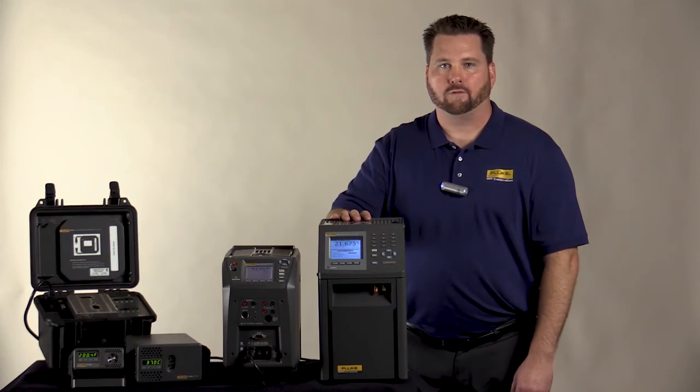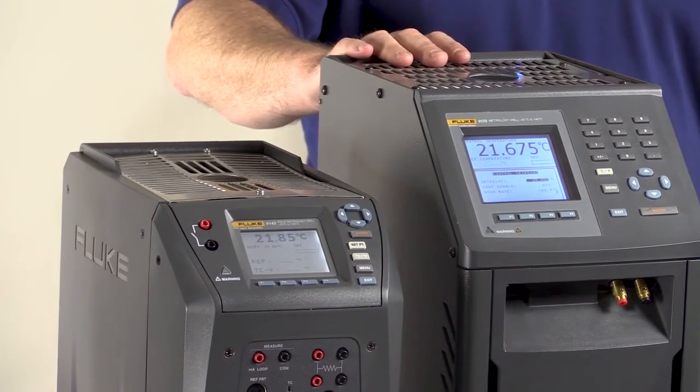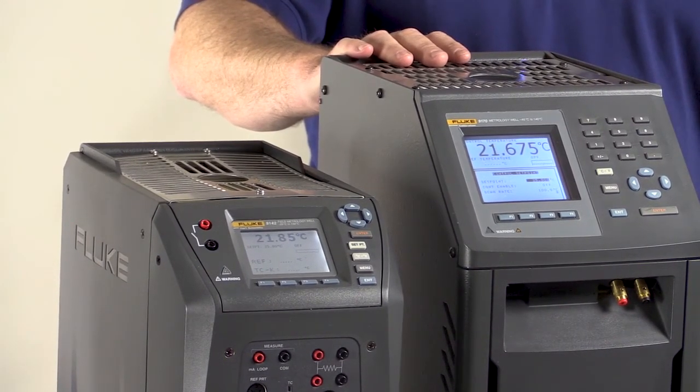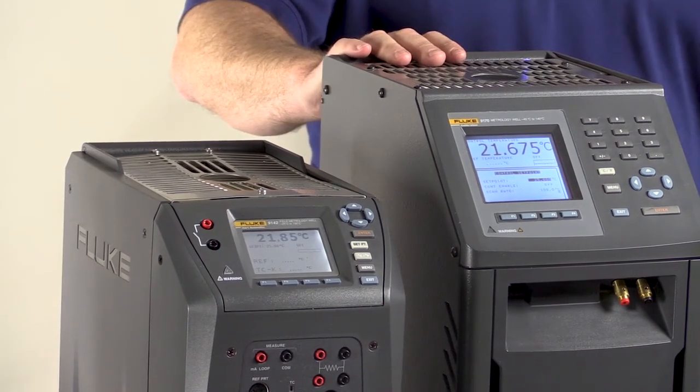For lab work and very accurate measurements, we have our 917X series. These units provide you the most flexibility as far as temperature range. Depending on the model, you can go as cold as minus 45 all the way up to 700 degrees C.